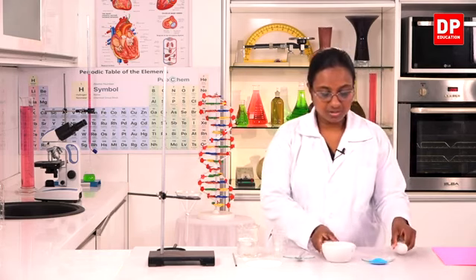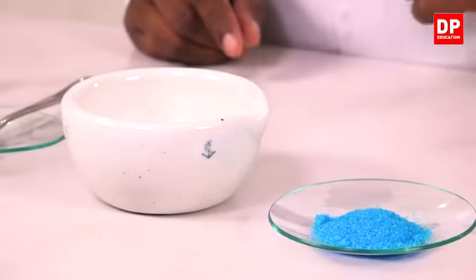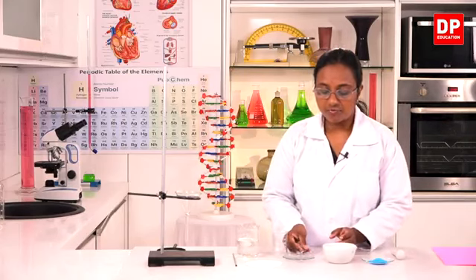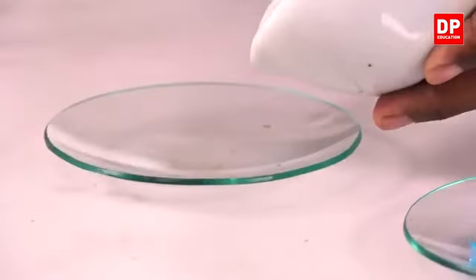Now students, you can observe these are two substances. One is the blue color crystalline powder and the other one is the white color crystalline powder. Now we have to mix the two powders. I will transfer it.